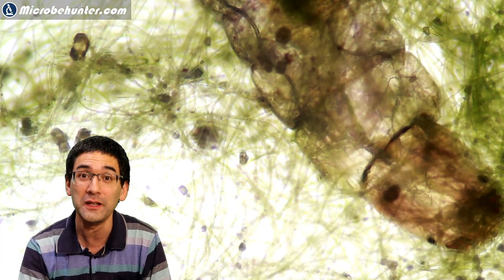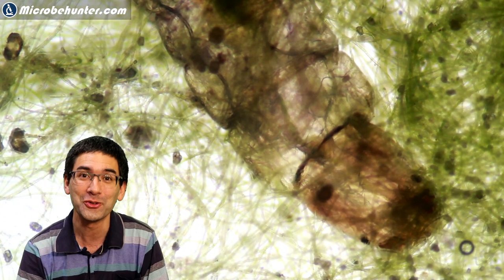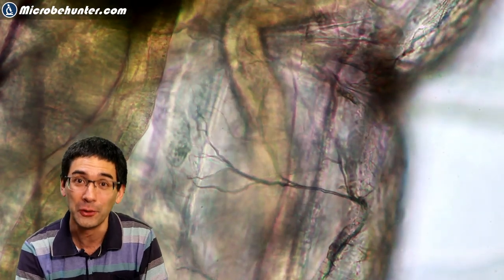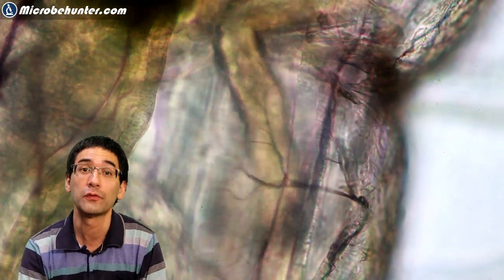Then they form a pupa, and you have an adult mosquito. The nice thing about these larvae is that they're transparent. For this reason, you can see all the movement of the organs—blood vessels and trachea, which are the network of tubes they use for breathing.